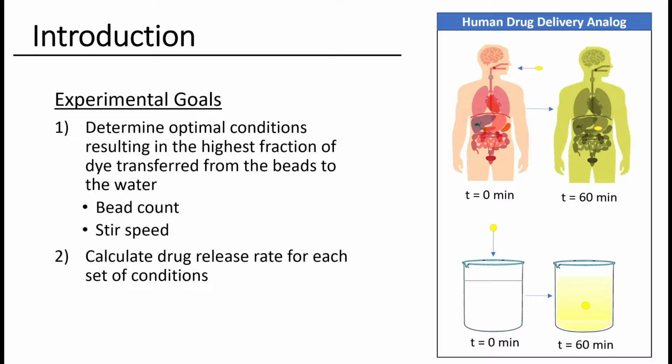As you can see in this graphic, our experimental design is meant to serve as an analog to drug delivery in the human body. The introduction of the tartrazine-filled agar beads to the water beaker simulates the intake of a drug through the human digestive tract. After an extended time interval, the dye will diffuse throughout the entirety of the beaker, similar to how a drug would diffuse out of its capsule and be transported to the rest of the body.